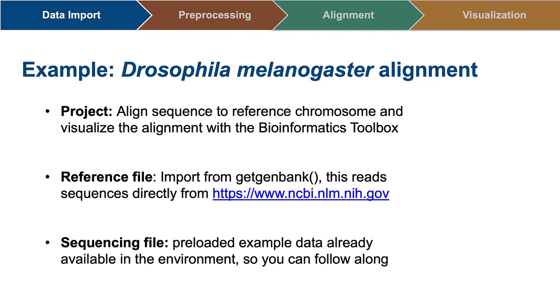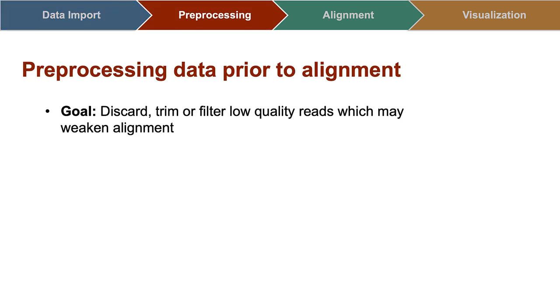For importing sequencing files, typically these can be imported with FASTQ read. However, MATLAB has some preloaded FASTQ files that I'll be using so you can follow along.